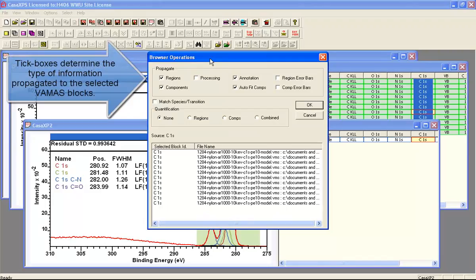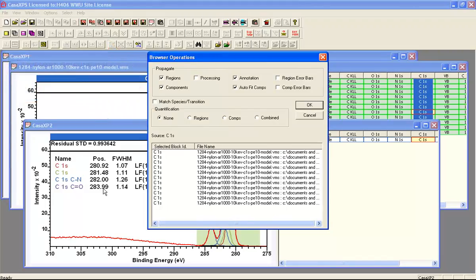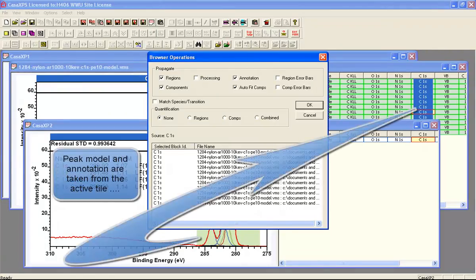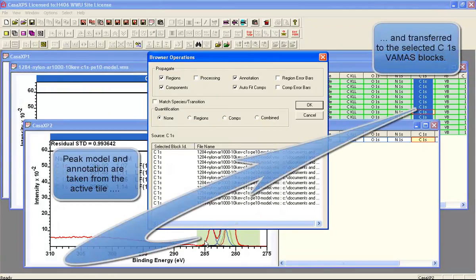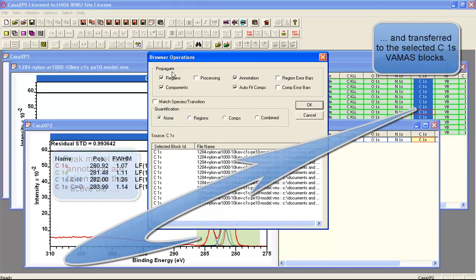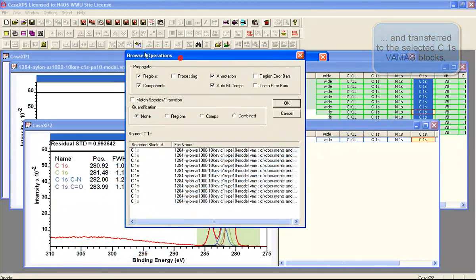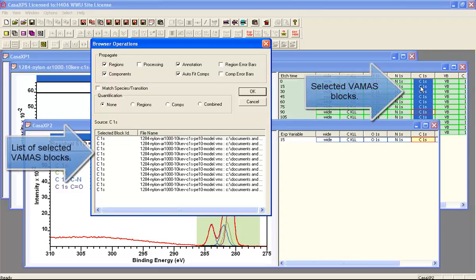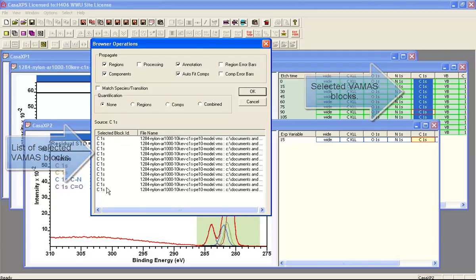What will happen is that the data within the active tile will be the source for the peak model and the annotation and the components and regions that make up the peak model. And I can propagate to all the VAMAS blocks that are selected here in the right-hand side, and they will be listed in this list that you see on the propagation dialog window.